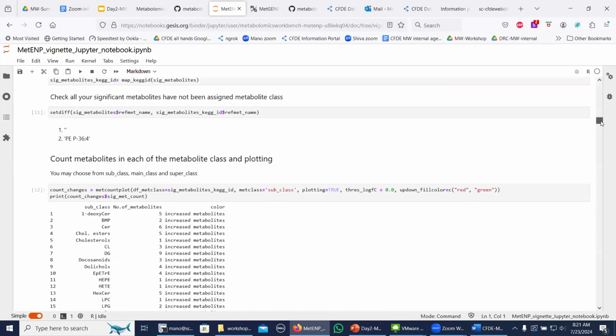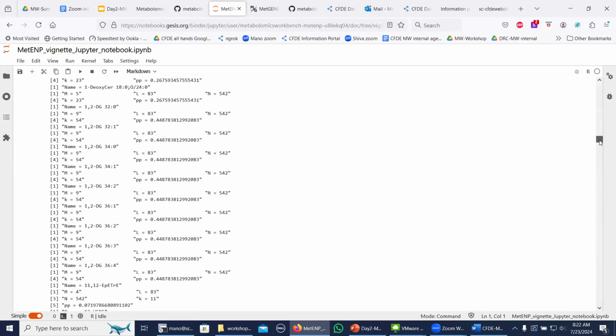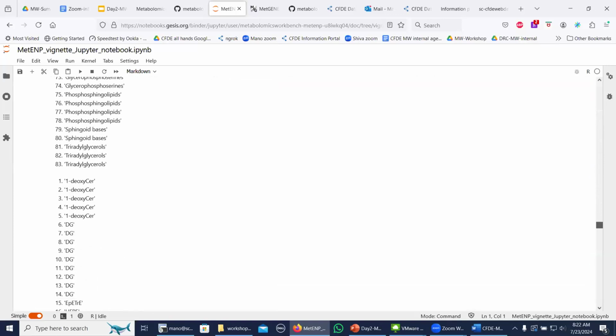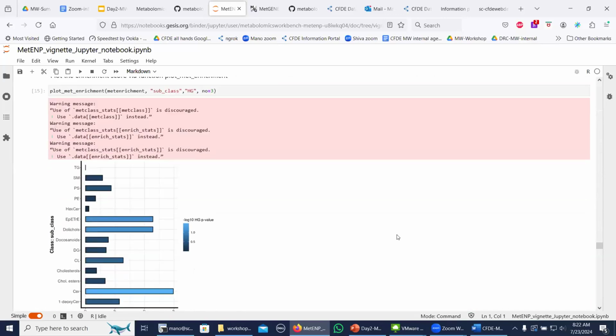Essentially, this provides all the same results that we saw earlier, but with the ability to make changes yourself and test out various things. Sometimes I add quite a bit of debug lines so that if there are any issues, I will get all the information. So Jupyter notebook is helpful from that point as well.